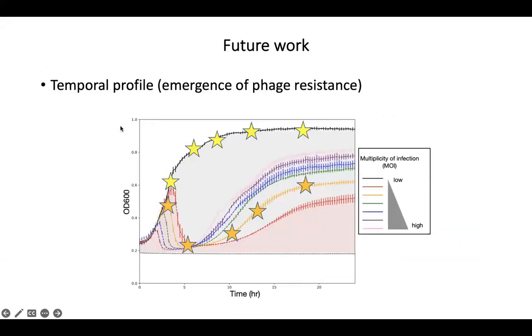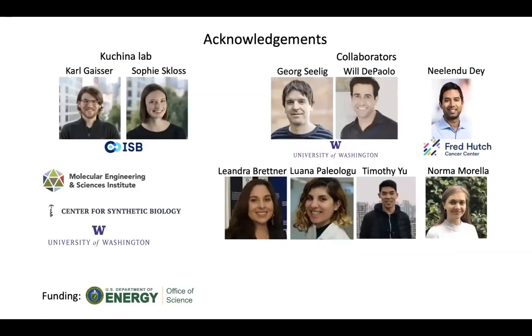And then, of course, we are literally right now performing the temporal profile where we want to capture this emergence of phage resistance and see what the single cell transcriptomics changes in the cells are. All right, so with that, I'm done.